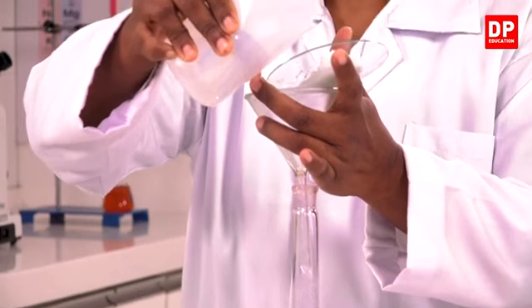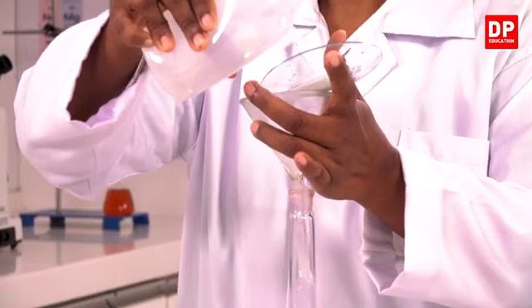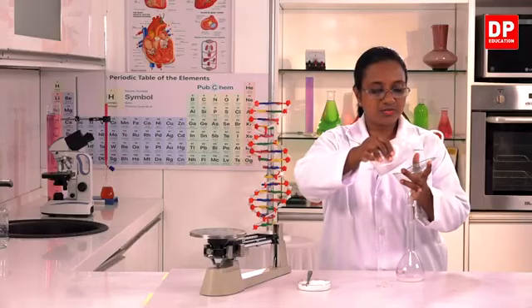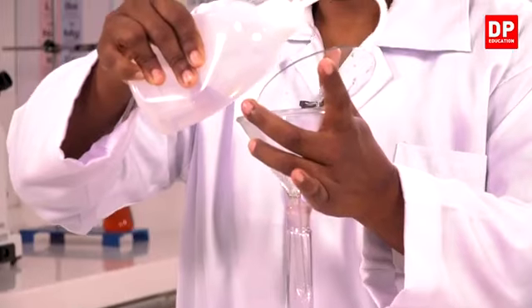So that is the use of the wash bottle here. We can make sure that we transfer all the solute into the volumetric flask.